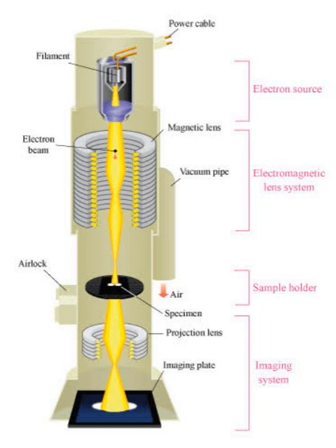Beneath the filament a cathode shield is placed. A high voltage which can be varied from 50 to 100 kilovolts is applied to the anode. The life of the tungsten wire filament is limited and it usually requires replacement after 15 hours of viewing.